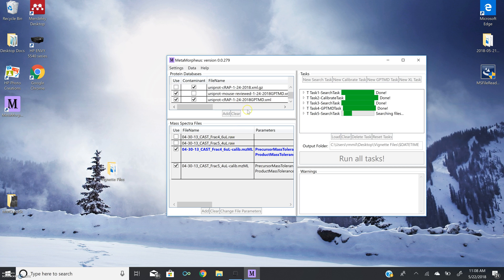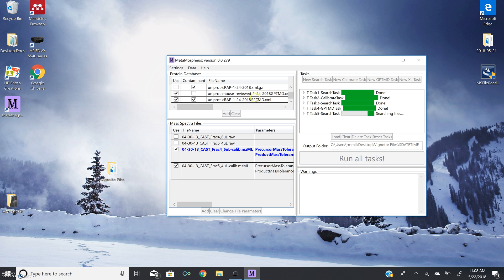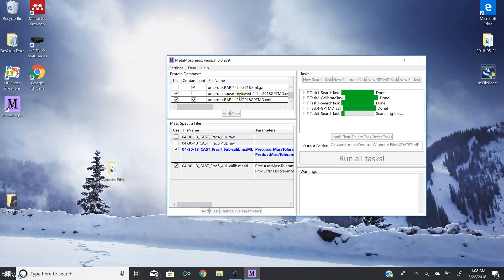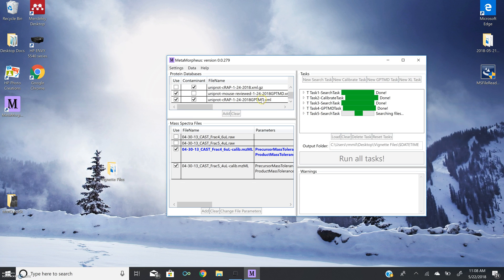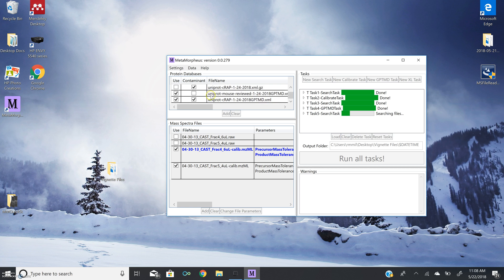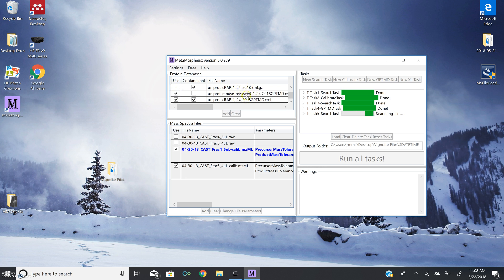Now with the completion of our GPTMD task, we can see that we have created additional databases for searching. We have created an enhanced database of our mouse containing all of the post-translational modifications and a GPTMD-enhanced contaminant database. And these are automatically put into our protein database window. And if you'll notice, now these databases have been clicked for use and the original databases are unchecked. So our GPTMD-enhanced databases will be used for all subsequent tasks.